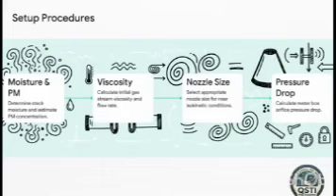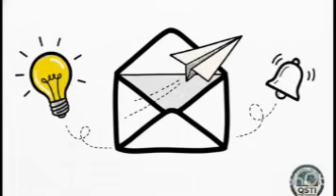This delta H is the exact target you're going to lock into your control box during the test to guarantee that steady flow.